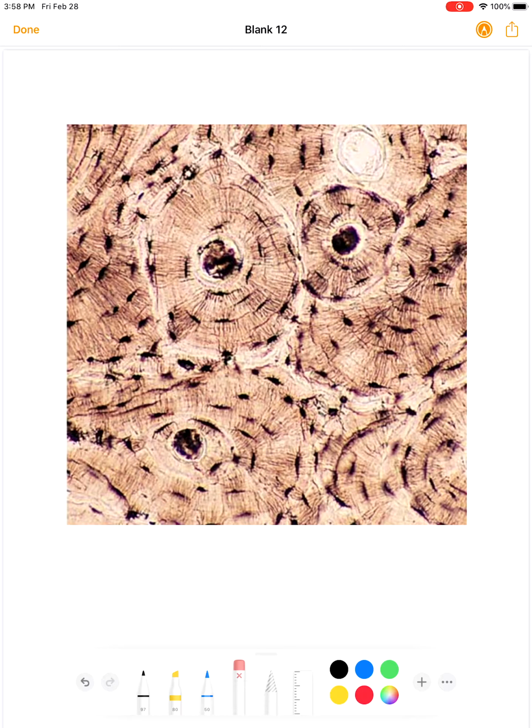This video is going to be on the microscopic structure of compact bone. And that is what you're looking at right here, a microscopic image of some compact bone. Now keep in mind that compact bone is found around the edges of the medullary cavity and the diaphysis of long bones. And it's also found around the edges of the epiphyses as well. So just keep that in mind. That's typically where you find those.